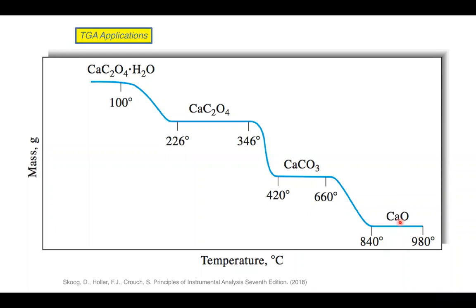So why is this interesting for us? It's interesting because it's a way in which you can model the decomposition of your product. If you want your product to be long lasting, you can do this kind of TGA study as a model, because obviously you don't know the exact environmental conditions all the time. You don't know how hot it's going to be. It's never really going to be these sorts of temperatures on Earth, at least not at the surface.